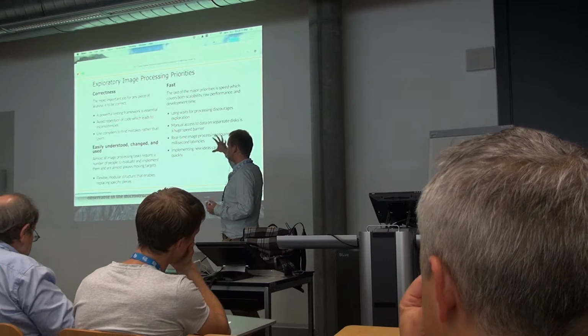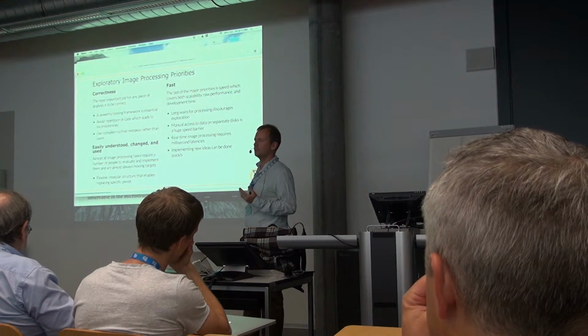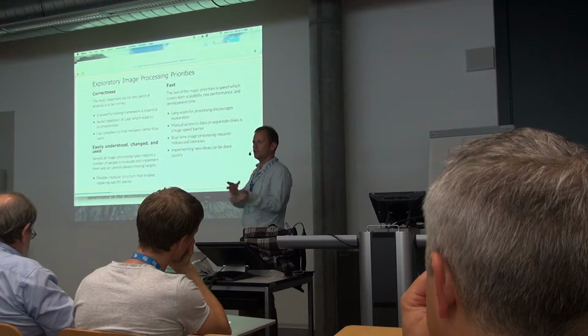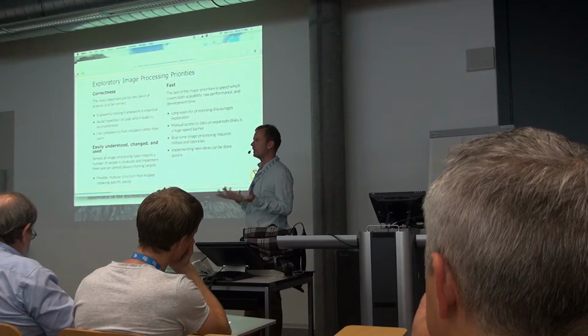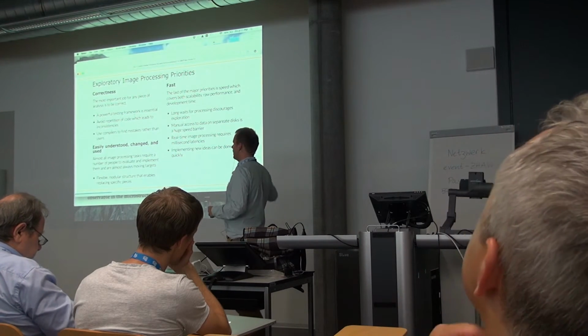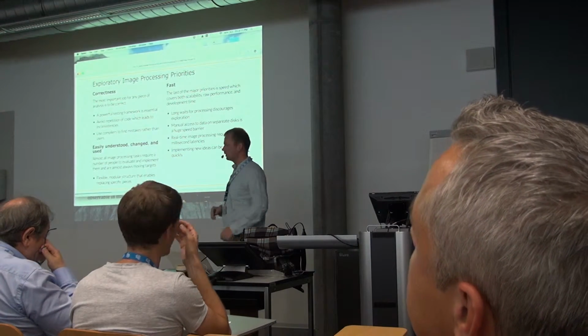The second is sort of fitting into that, and that's this easily understood, changed, and used, is that we find out with a lot of the samples we analyze, what we thought we wanted to know is very different at the end than it was at the beginning. And so having something where you can quickly switch out parts and change the analysis makes your life much easier and causes you to play with it much more.